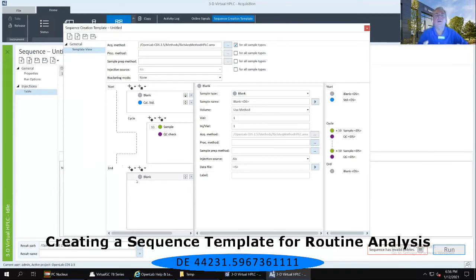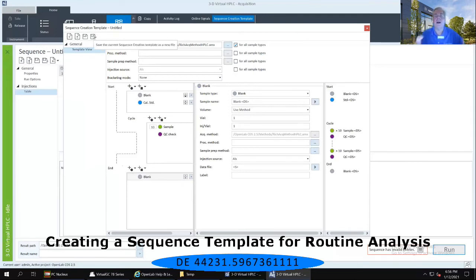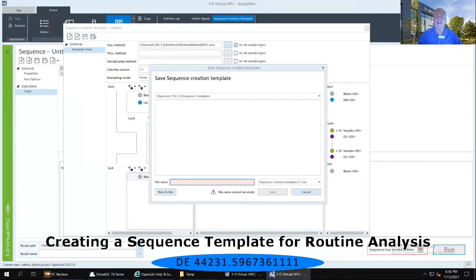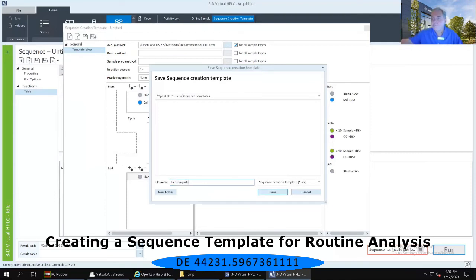We have now created our sequence template. It might take some time — maybe 20, 30, 40 minutes to create your sequence template — but I'm going to show you where you save time in the long run. We need to save the sequence template by selecting the icon in the upper ribbon just underneath where it says 'sequence creation template dash untitled'. The fourth icon from the left is the one with that old-fashioned disk drive with a plus. Click on that to save the sequence creation template, give it a name like 'rich template', and notice that it's going to be saved as a .STX for a sequence template. Then select Save.